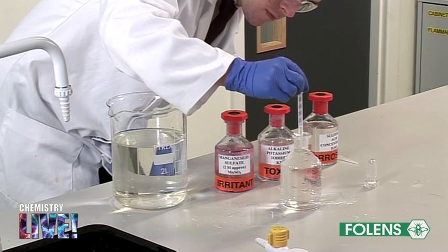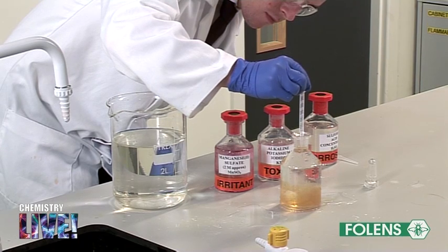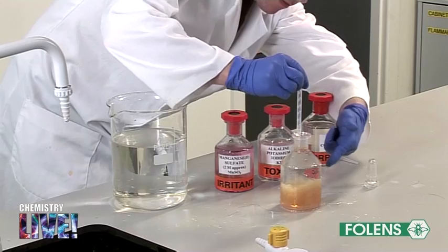Since both solutions are quite dense, note that these solutions sink to the bottom of the bottle. Note the brown precipitate being formed in the bottle.